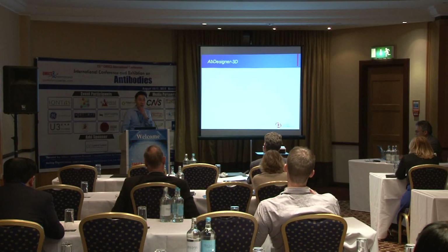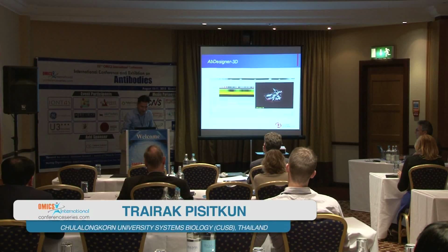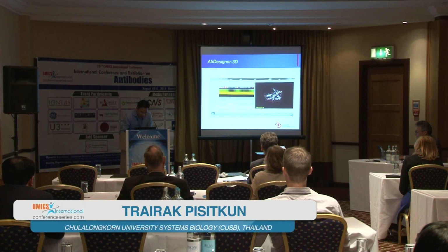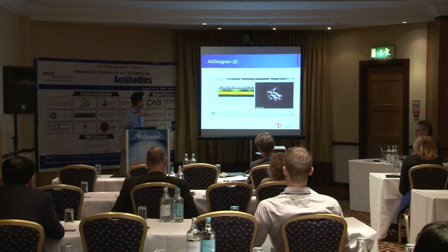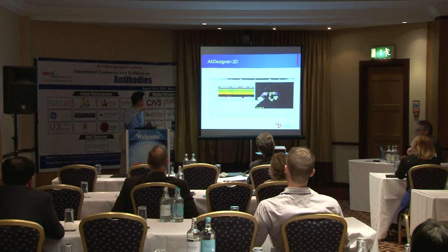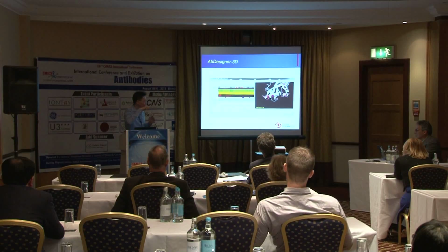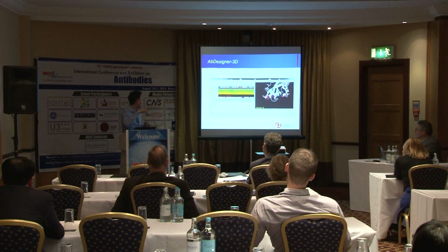And we are right now developing the 3D version, since the previous version is only for the primary structure, where we predict from the sequence. It's under development. For the 3D, we calculate the area, called solvent accessible area. It has more interactive features, so you can select the color and it will highlight the location. We are testing it right now. Basically, the more area that is sticking out, the more red.